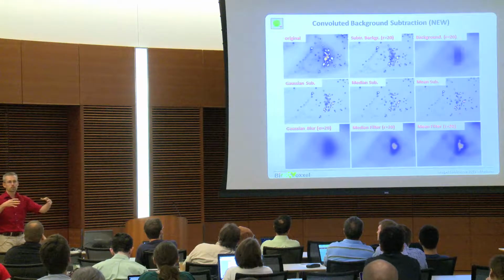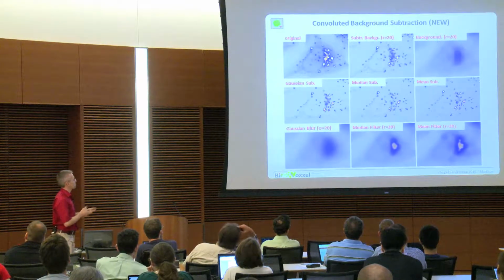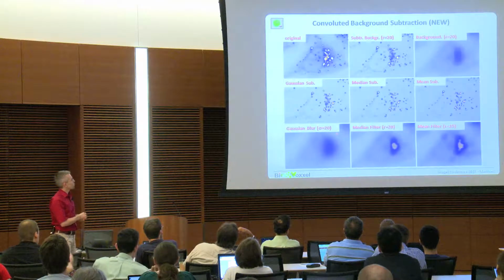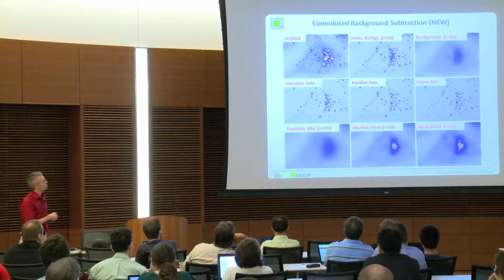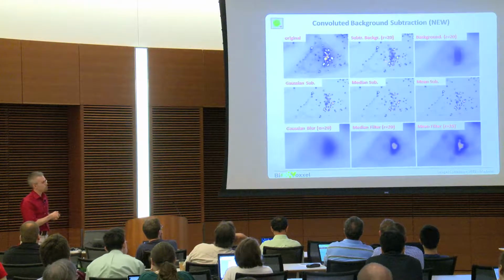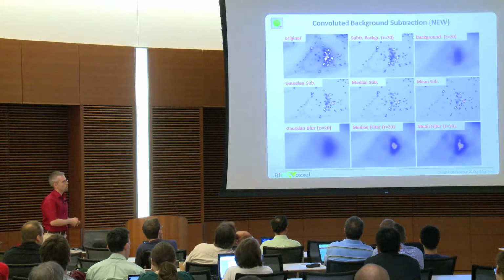Normally the particle size is also a good estimate to start with. If you key that in, there is a preview function, as you see there. If you click on this preview function, you will directly see your original with the background subtracted. In comparison to that one, you see that at least for those two, and also for this one, the background subtraction is stronger. But also here, the particle is slightly affected, so we need to be careful.